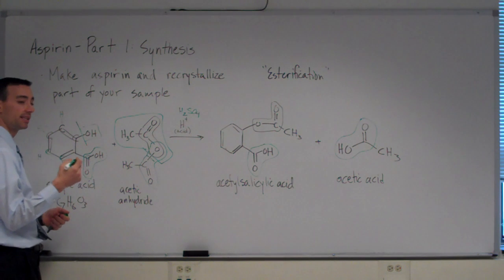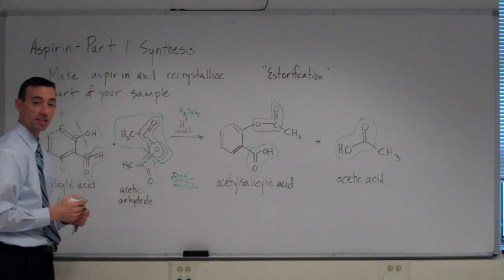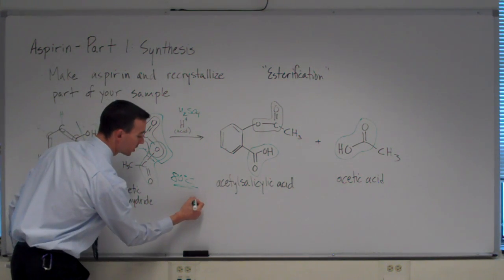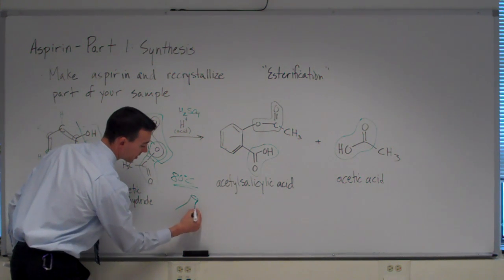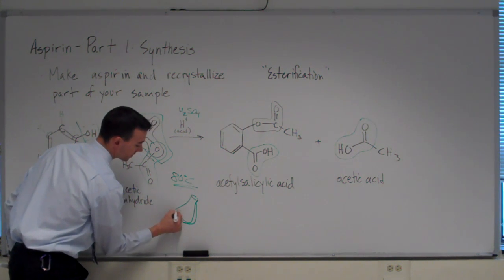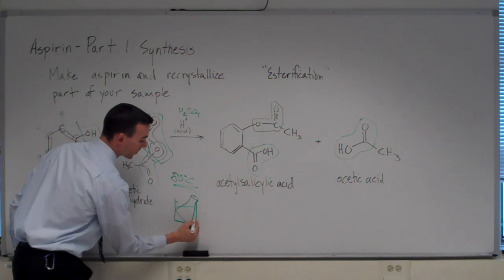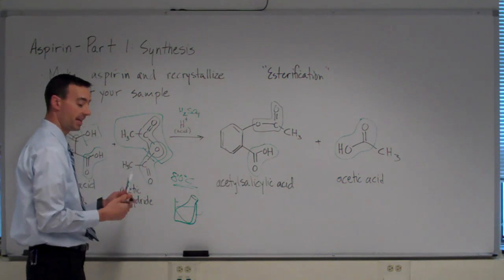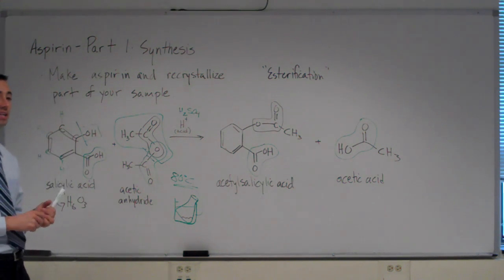This whole process is optimized if we conduct it at 80 degrees Celsius. And so you will immerse your reaction, which can simply take place in an Erlenmeyer flask, in a beaker. And you can then fill the beaker with some water that is at 80 degrees Celsius. And this will maintain your reaction inside the flask at 80 degrees Celsius.